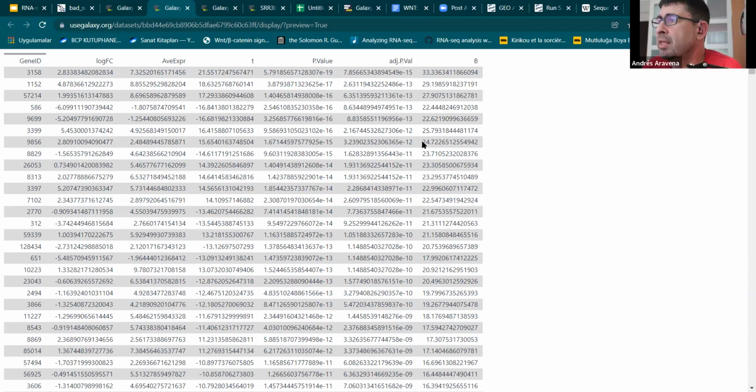It's the kind of question that you will like to ask. I think that most of the time, this is the thing that we like. And a question: does this show everything, or just the genes over some p-value? This shows everything, after filtering the low counts. It is filtering that and then doing the calculation.